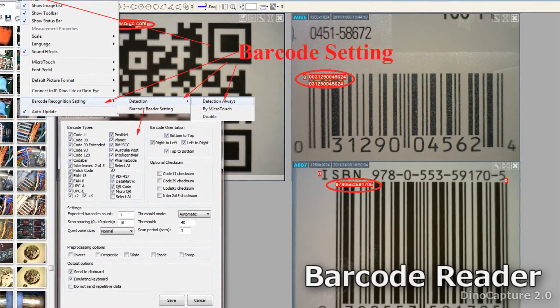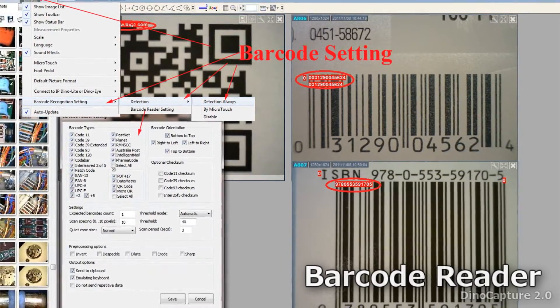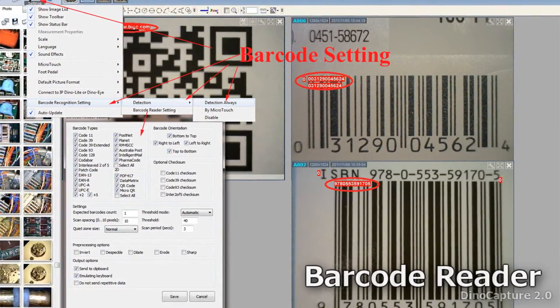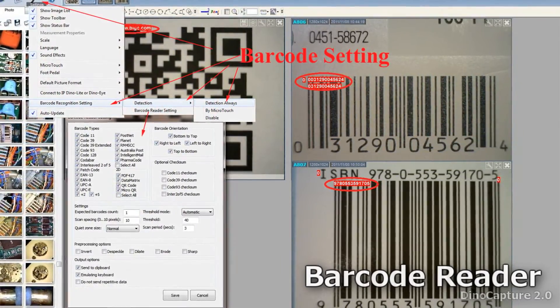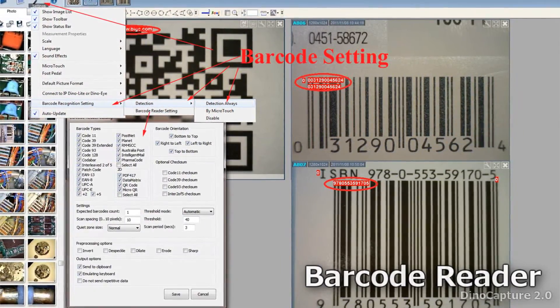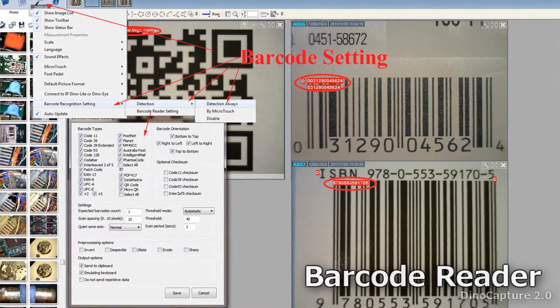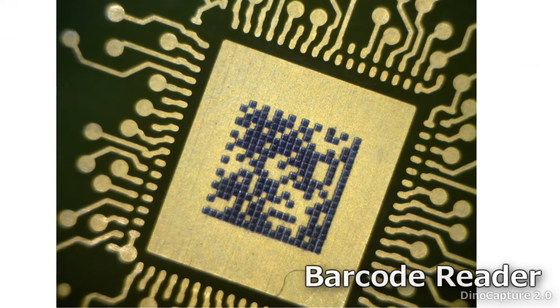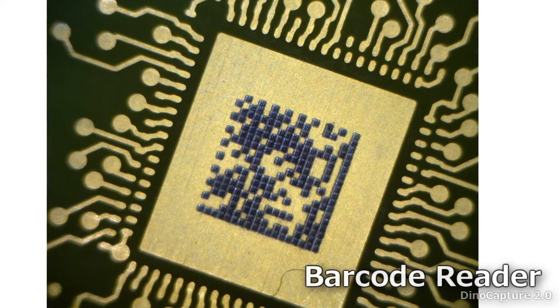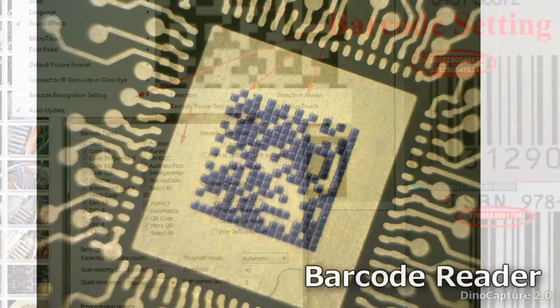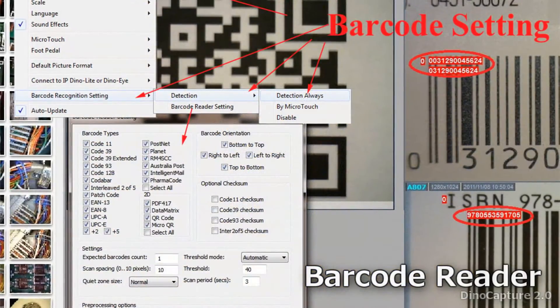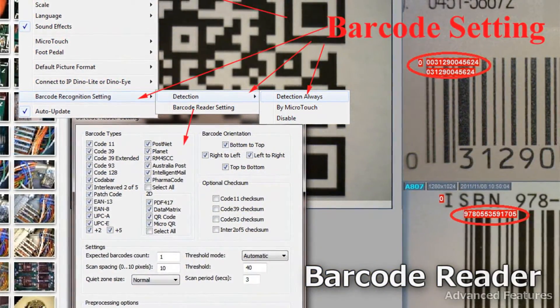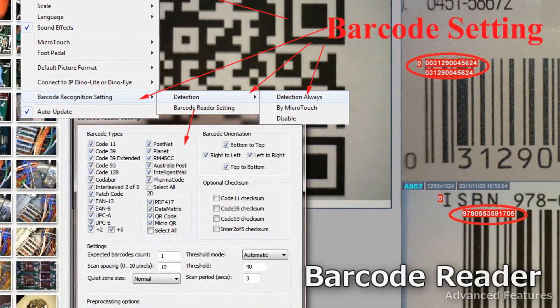The DynoCapture 2.0 software has a barcode reader feature built in. You can access these features by going to Settings, then Barcode Recognition Settings. You can also designate whether to always automatically detect barcodes, detect with microtouch, or disable.